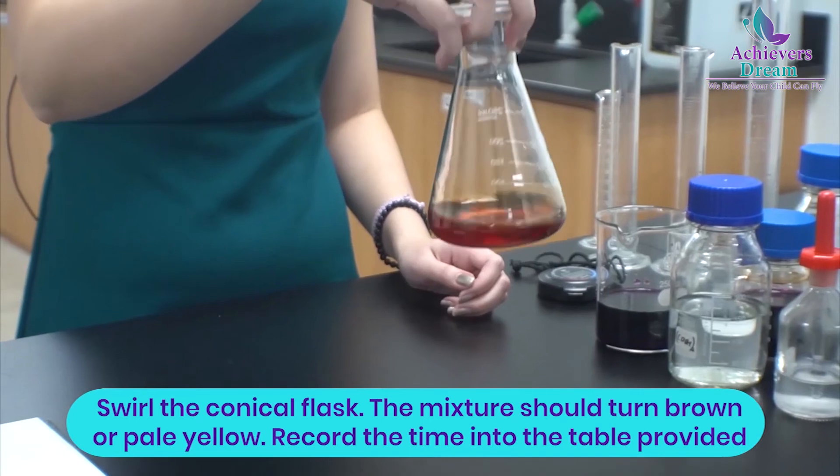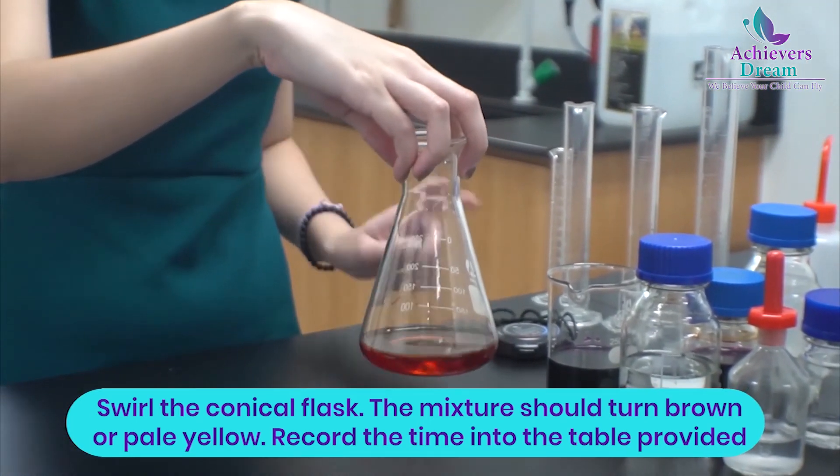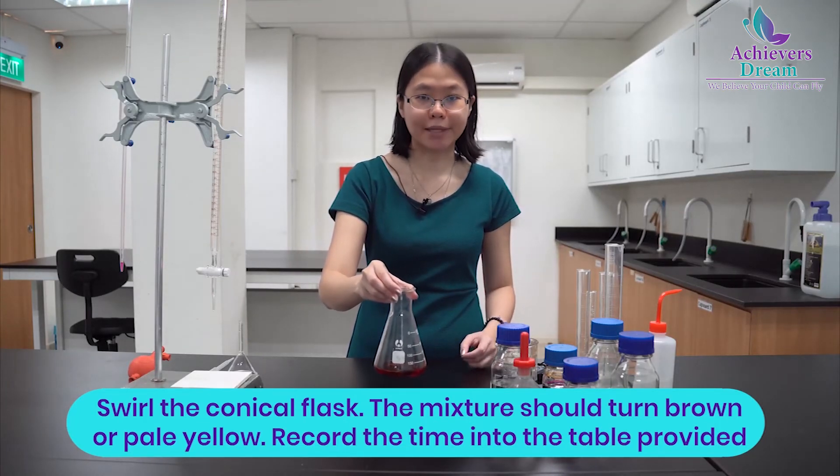The solution should turn brown or dark yellow at this point. Record this time in minutes and seconds to the nearest second in the table provided.